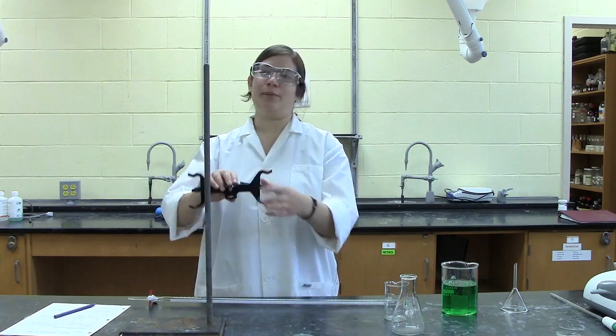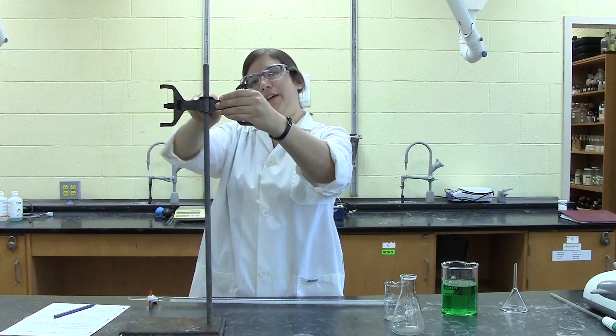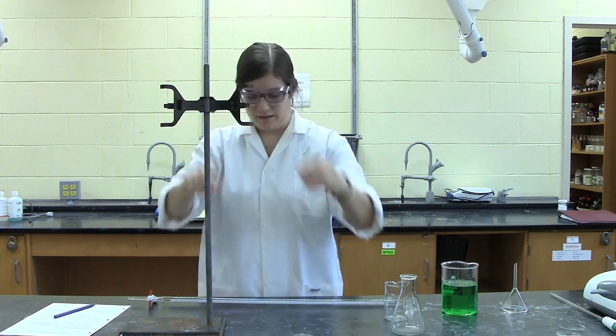To use a burette, first attach the burette clamp to a retort stand by sliding it over the bar and turning the screw to make sure that it's steady.